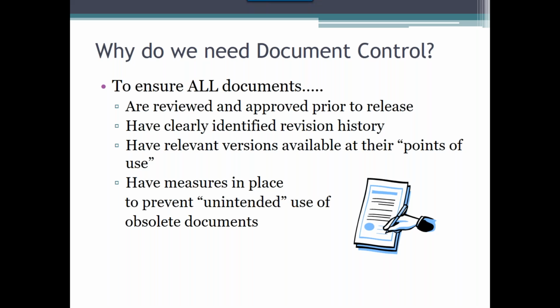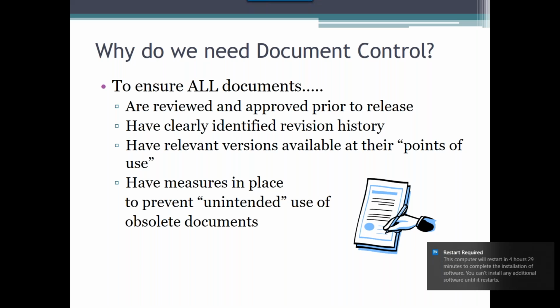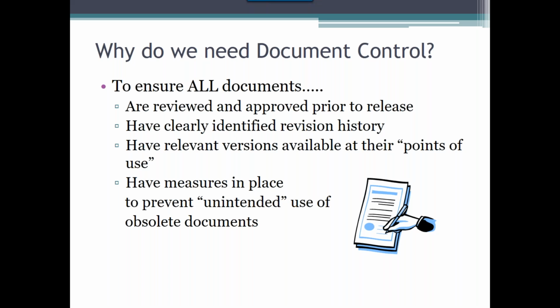It ensures that we are always using a current version of a document. Additionally, it is a mechanism to track all changes that have ever been made to a document, including when they occurred. Changes to a document should be tracked on an ongoing basis, including the archival or retirement of the document. This is important in the life cycle of a document, so you can always determine exactly what version of a document you had in place at any particular point in time, and you can tell when edits were made and what exactly the edit was.